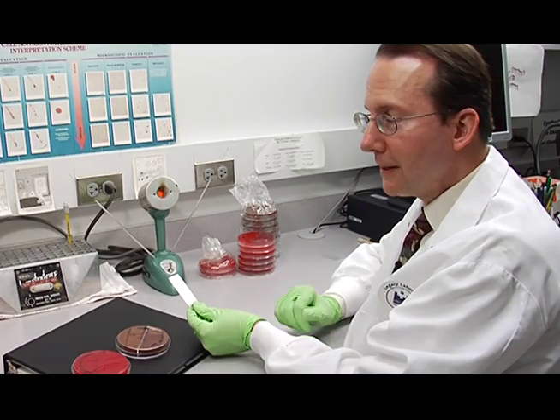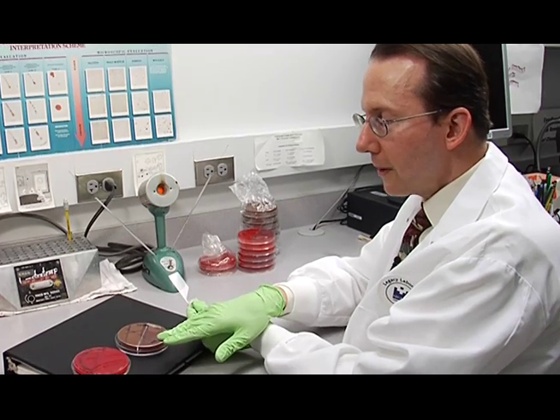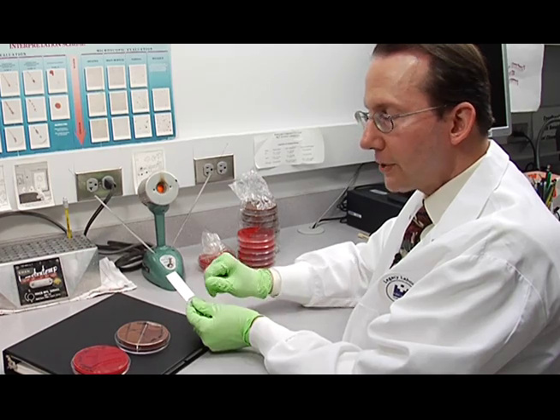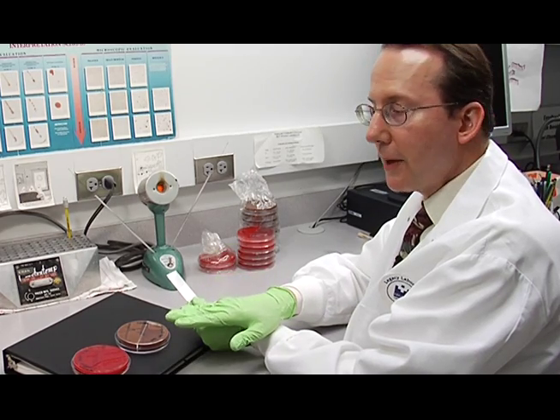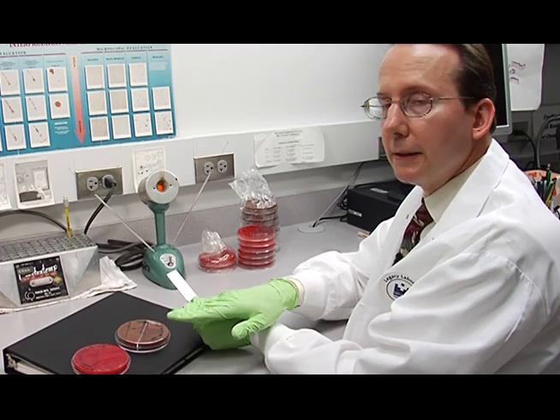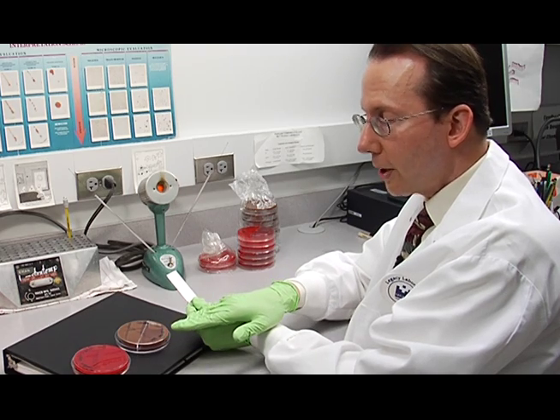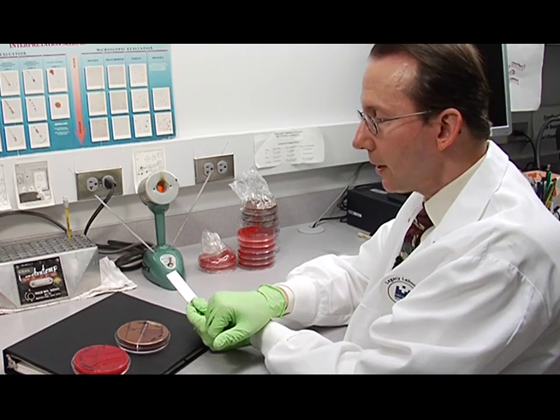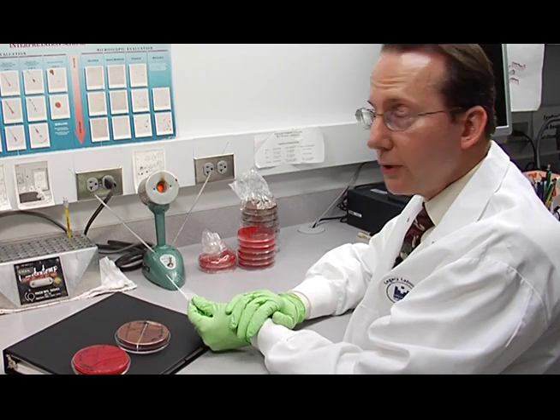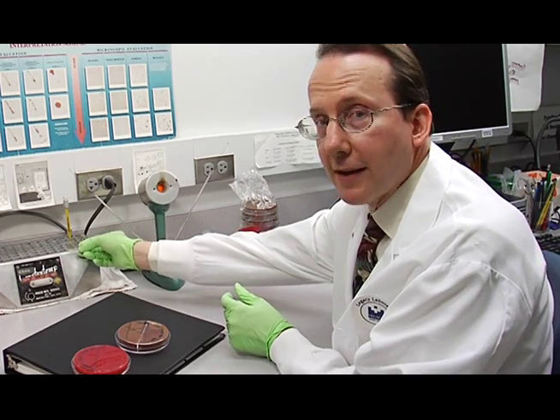So now we have inoculated the blood agar plate, the chocolate agar plate, the Martin Lewis medium, and made our smear. This is the general sequence for setting up any culture — it's always blood agar first, then from least inhibitory to most inhibitory. In this case, chocolate agar, then Martin Lewis agar. And then always make your smear last. You can place your smear on a heat block to make it dry faster if you like.